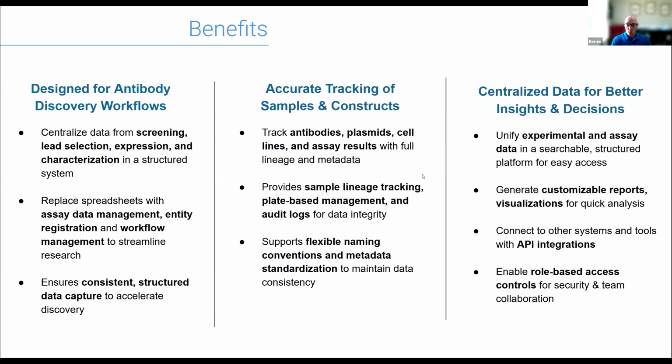You want that to be well integrated, probably automatically, with the upstream stuff upon which you are actually trying to decide. You want somewhere to document your operations for improved reproducibility and a more objective understanding of what you actually did and why, as well as an easy way to return to your data for insights, decision making, planning future work, stuff like that. And of course, controlled access, full auditing, so that you can actually solve problems that arise from your data.